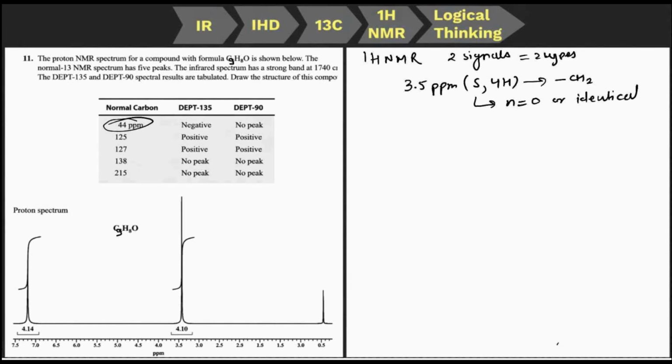Okay, now we have another signal around 7.2 ppm, which for sure belongs to the benzene protons, and this is also a broad signal and belongs to 4 hydrogens. So this further confirms that our benzene ring is disubstituted. We have already confirmed this from the carbon NMR. Now further confirmation comes from the proton NMR that it is disubstituted.